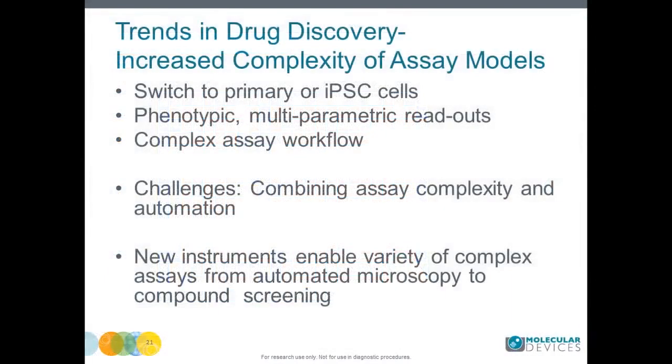The next part of our presentation is dedicated to multi-parametric assays for compound screening and toxicity assessment. The latest trends in biology are highlighted by an increase in complexity of assays that includes complex cell models and phenotypic multiparametric readouts. The instruments have to enable increasing complexity of assays and also ease of use and throughput.